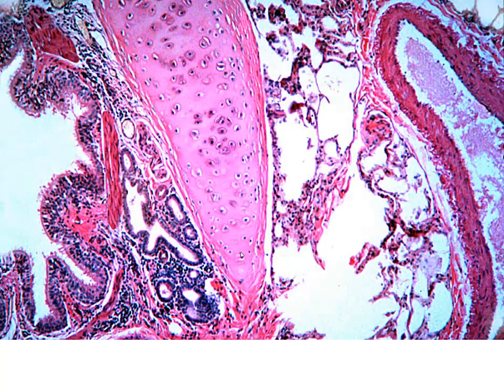Again, taking a closer look, here we can see even more so our typical hyaline cartilaginous material, pseudostratified epithelium in the mucosa. Maybe you can guess that this is ciliated. We know we're in lung tissue because of the alveoli that we see. So that's going to be an easy leap to understand that we're looking at our respiratory type of epithelium and it's pseudostratified with cilia.